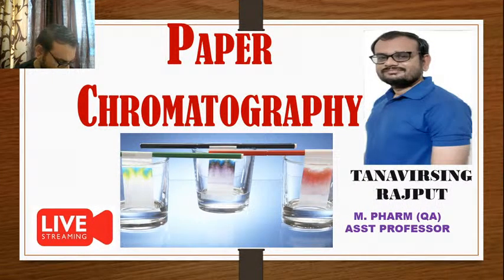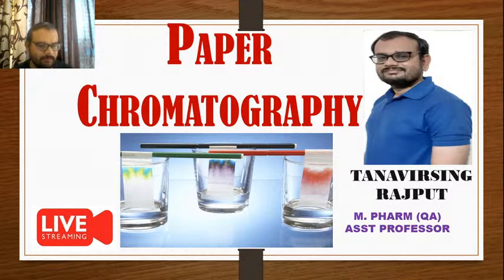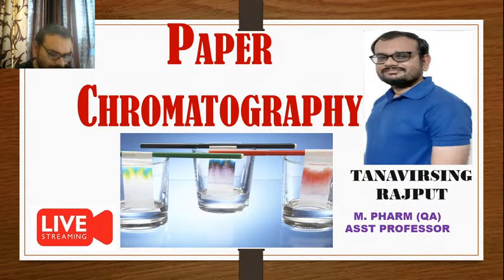So in this session, we are going to cover one of the most widely used and the simplest techniques of chromatography, that is paper chromatography. The main attraction with respect to paper chromatography is that it is very simple, very widely used, the most widely used technique. And why is it so widely used? What are the distinctive factors or parameters which make it widely acceptable throughout analytical chemistry or analysis?